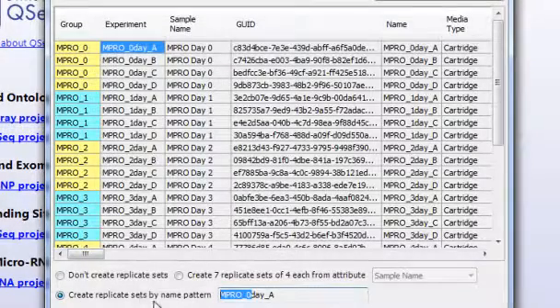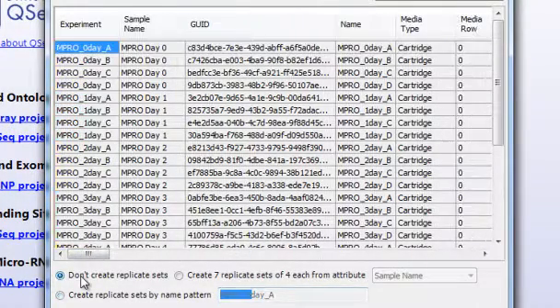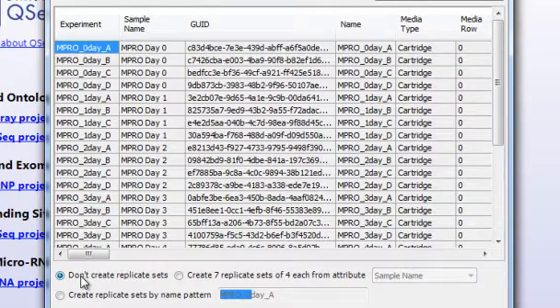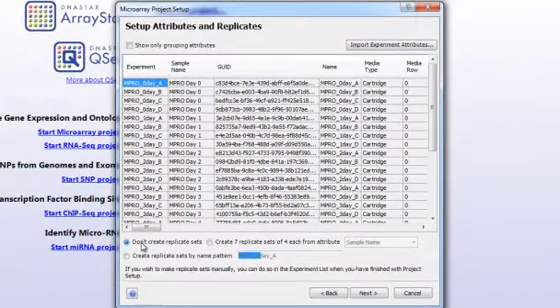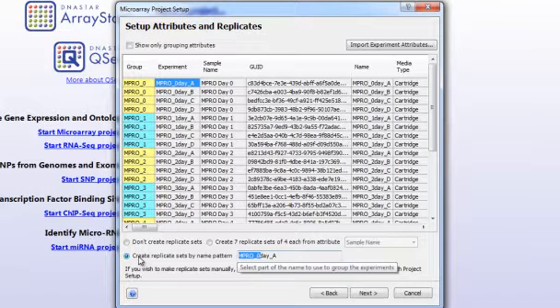Finally, you can choose not to create replicate sets at this time. You can still create replicate sets at a later time from the Experiment List view. For this particular example, we will create replicate sets based on name pattern.